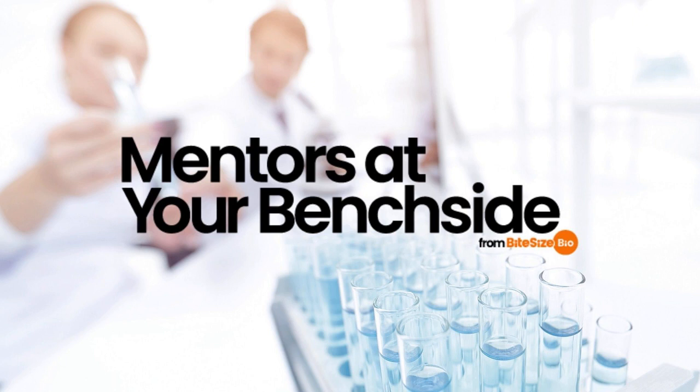So why is it important to be aware of the trueness and precision of our measurements? Understanding the concepts of accuracy, also known as trueness, and precision in the simple pipetting example is one matter, but it's trickier to identify and monitor all the factors that may affect accuracy and precision, as well as the resulting impacts on your results. Consider a situation where you are preparing custom cell culture media.